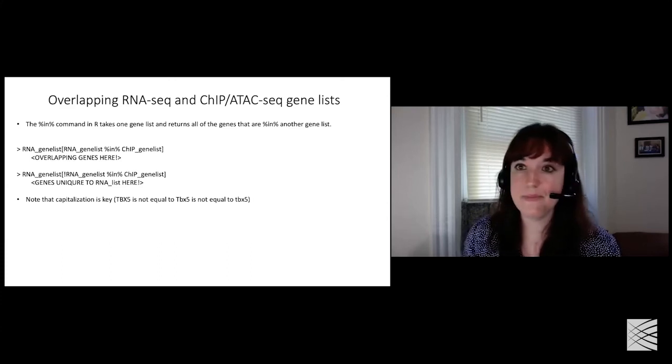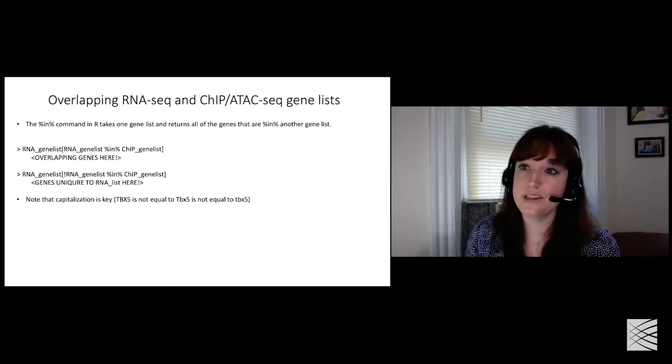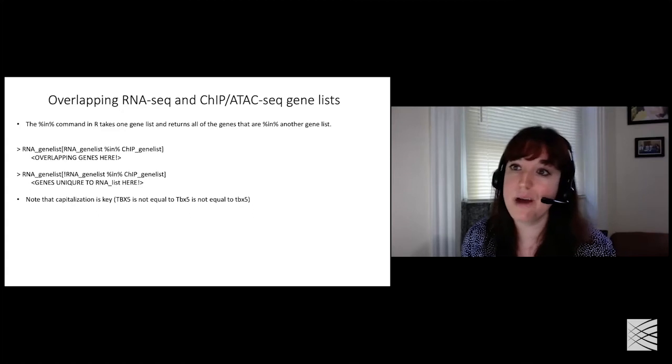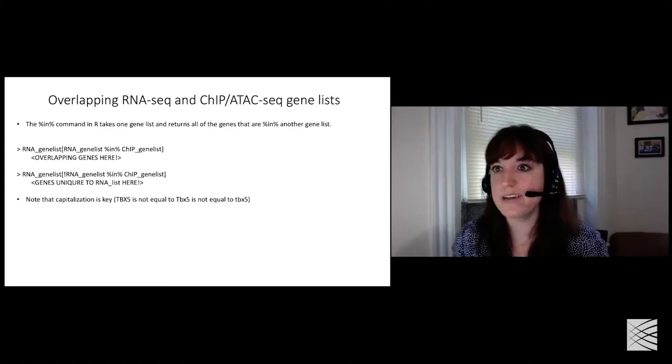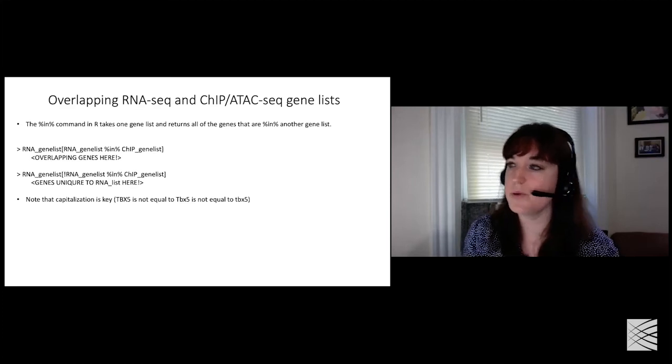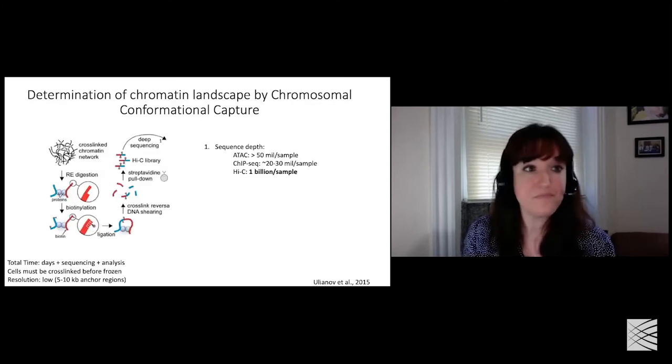All right. So I spent the first little bit of time talking about ChIP-seq and ATAC and how we can integrate this with RNA-seq analysis. I'm now going to go back and talk about Hi-C, which is pretty different than ChIP or ATAC, so I didn't talk about them at the same time. So we're going to talk now about chromatin capture and how we can use Hi-C data to kind of bring all of this data together.